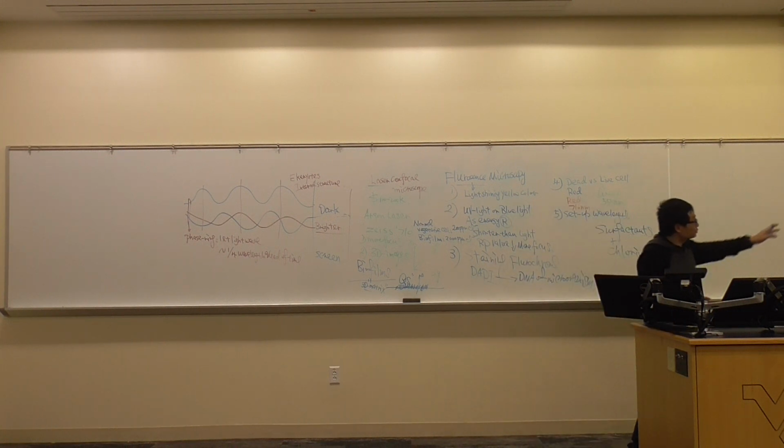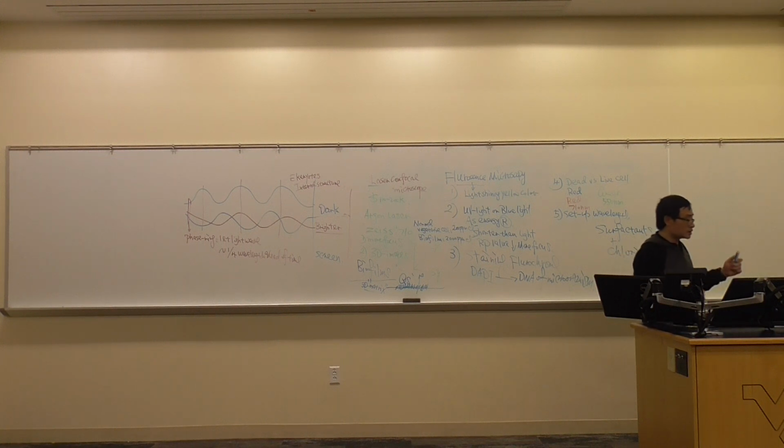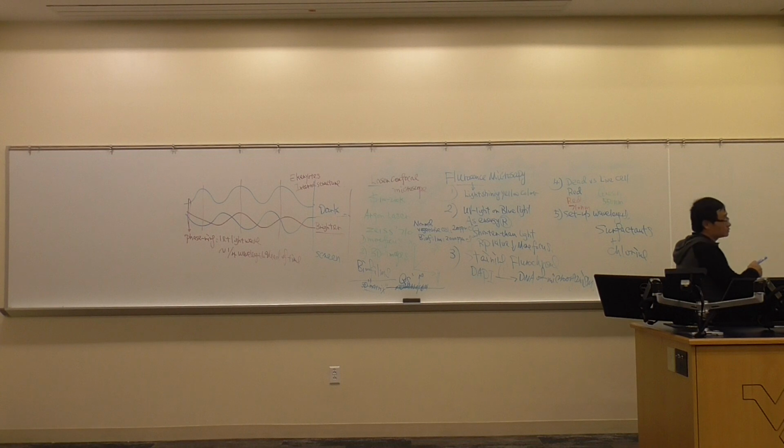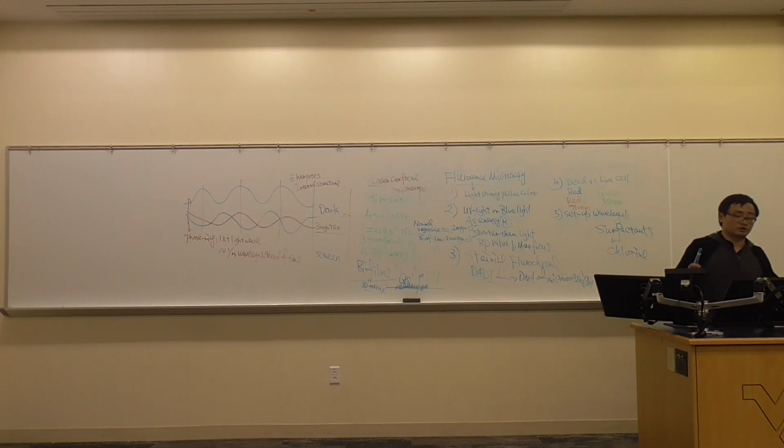Then what does it look like? The brownish color. Well, two cells still survive. We just want to make sure it's 100% killed. Is that too good? The color spectrum is right on the Z line, which means it's a brownish color, which means all those cells are most likely injured. So this is an example of a color spectrometer used in the confocal scanning microscope. But I didn't do the 3D images because it's not necessary. It looks similar when we did the comparison. Okay, so that is a laser confocal microscope.